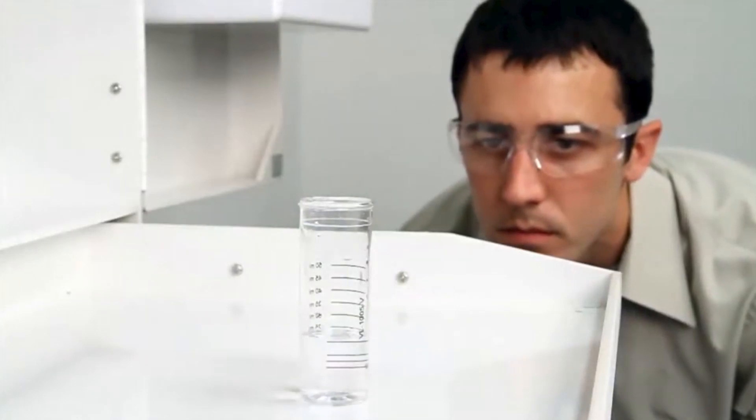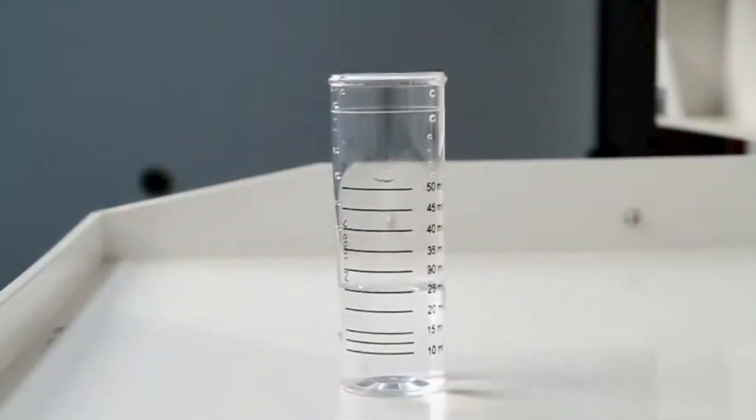When performing a drop count titration, a white background can provide contrast to better see the color changes. A cabinet tray or a white paper towel can provide that contrast.